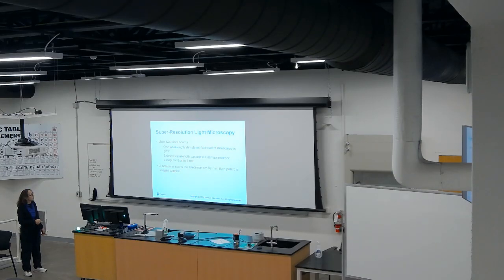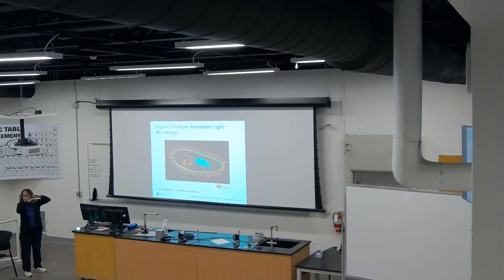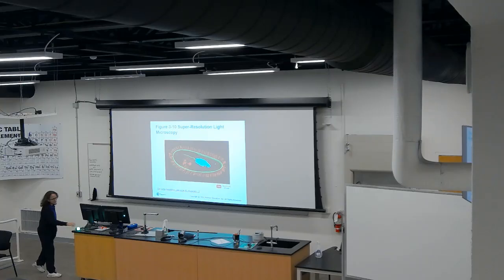So see how with laser, with one wavelength canceling background fluorescence, you can focus specifically on this area. And this is the side. I mean, you can go to the side and the middle, well, it's the edge, I should call it better. It's the edge in the middle, but what if you go and then just study this part? You will be able to see on the top all of these holes that form the channels.